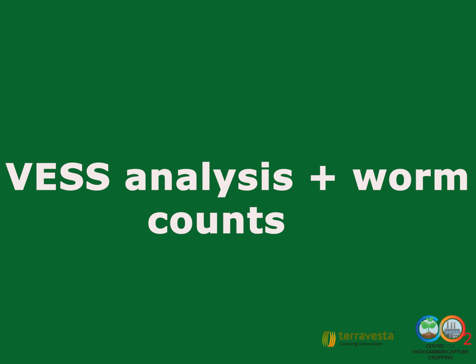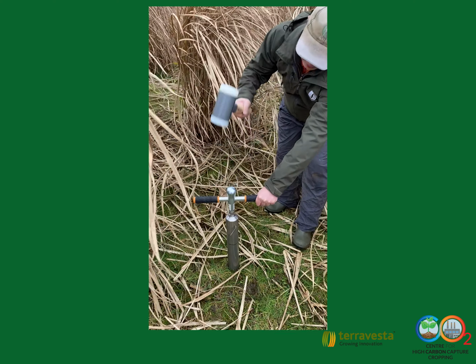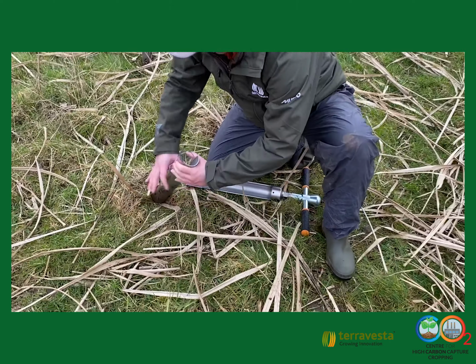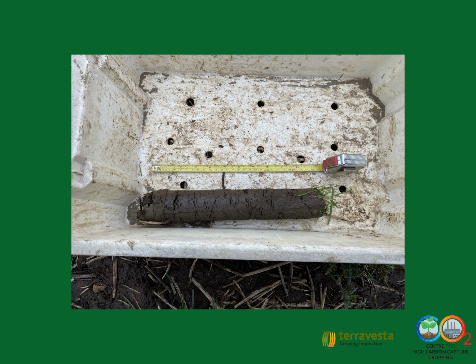In Terravesta's case for the VESS analysis and worm counts, again, we used a 40 cm split tube corer. Firstly, record the What3Words location for each VESS sample, then hammer the core 30 cm into the ground and remove by hand. Then cut off any extra soil below 30 cm and place the core onto a white sheet or tray. Place a ruler or tape measure on the soil block, take a picture and estimate the soil layer depths, assuming there's more than one layer.